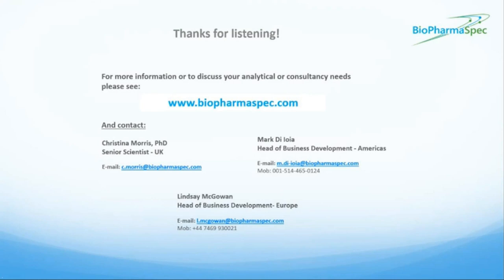Next question. Are you using nanoflow or microflow LC-MS in these methods? We use microflow most of the time. Nanoflow will be better for separation and for looking at these low-lying HCP numbers. So again, depending on your needs, really, you can tweak these methods and the LC conditions, etc., to improve your library. It is a balance, as I said, and it's just trying to work out what is appropriate according to what your strategy is, I suppose.